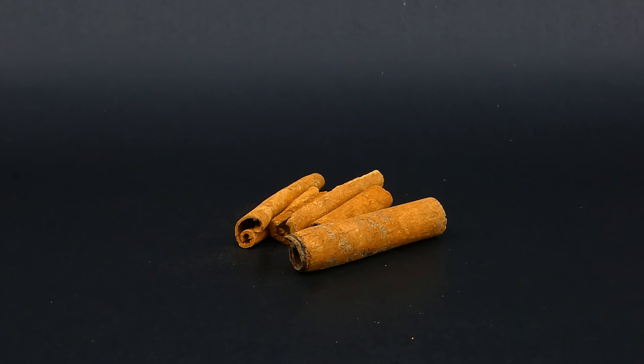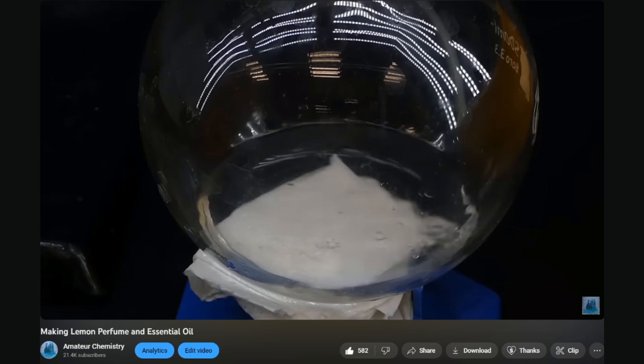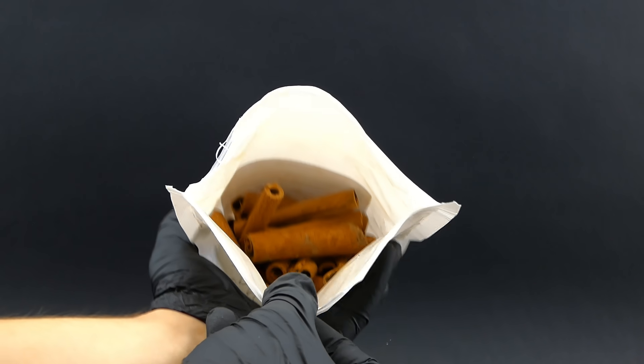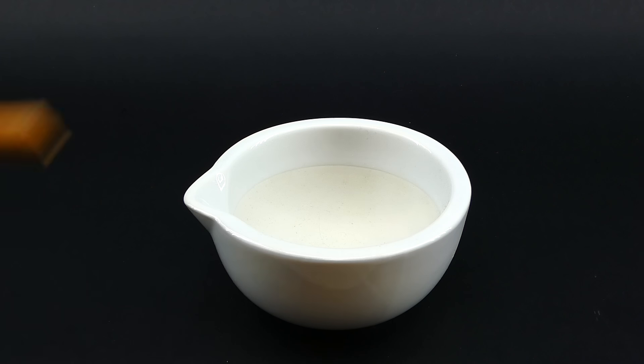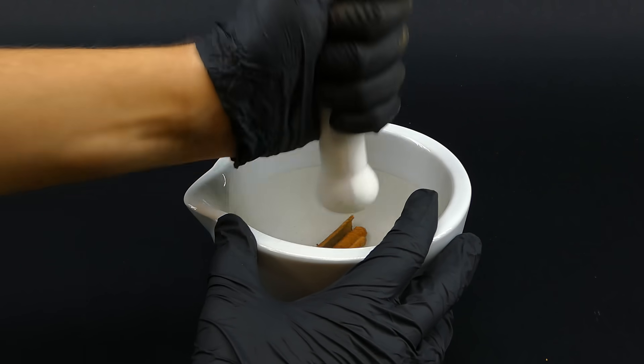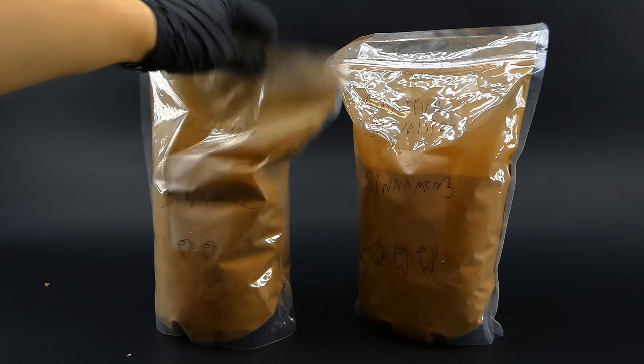To extract the cinnamaldehyde from cinnamon, I have to use a technique called steam distillation. I already made a video where I used it to make lemon perfume — it works by boiling something in water and then condensing its vapor, which allows you to distill over things that normally would be very difficult to extract. To begin, I brought these nice cinnamon sticks, but for the steam distillation I had to turn them into a coarse powder. After about 5 minutes of trying to use a grater or a mortar, I realized that would take longer than the current age of the universe, so I did the only logical thing and bought 2 kilos of powdered cinnamon. This is honestly a little too much for my needs, but I guess it's better to have more cinnamon than not.